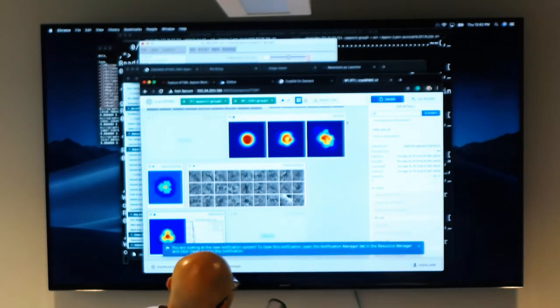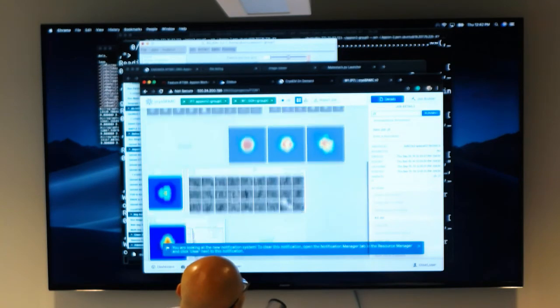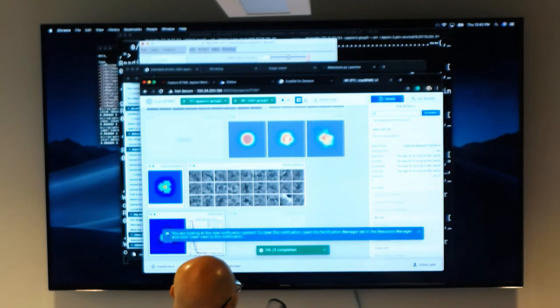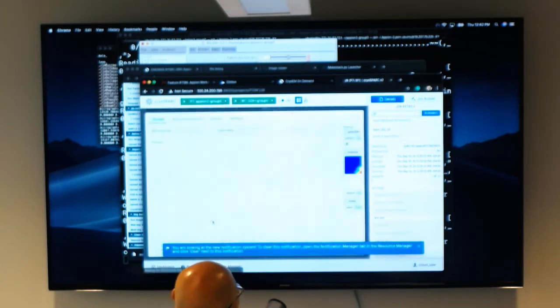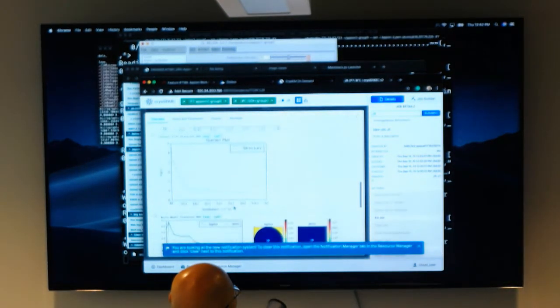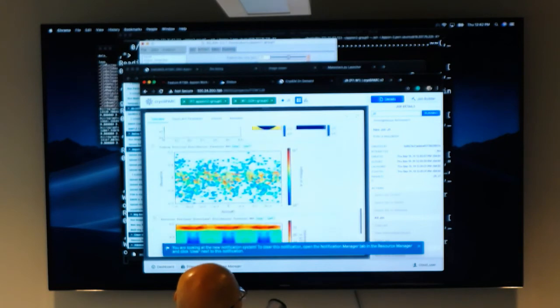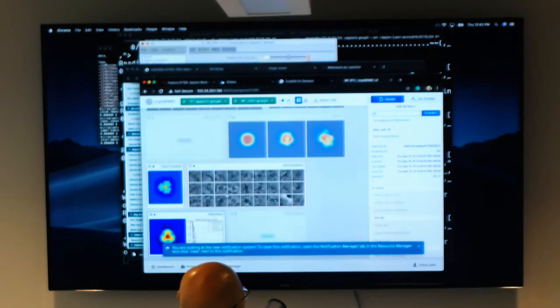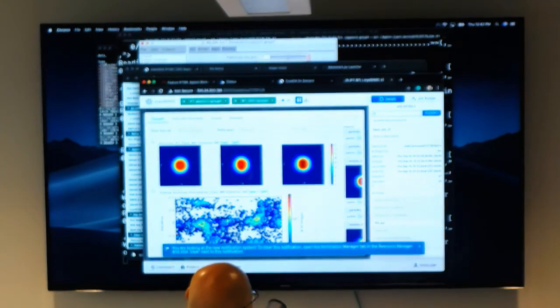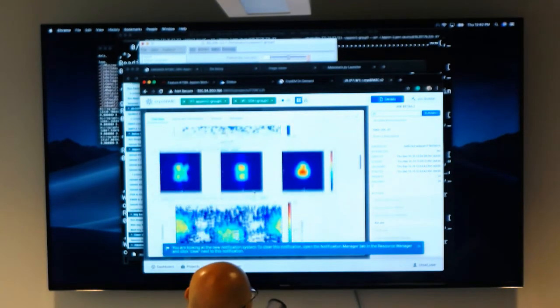Some people like this responsive feedback because as each iteration goes, you can see visually certain updates, right? And I've done multiple things at once. I've done ab initio as well as refinement, right? It also gives you a shortcut. If you go into each run, it gives you those orthogonal views, FSC, B-factor plot, also distribution of Euler angles or views. Even in ab initio, you can see the different models.